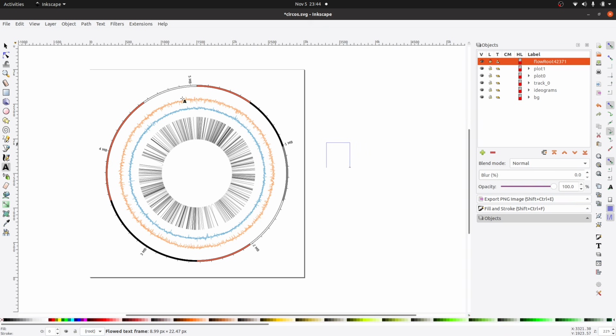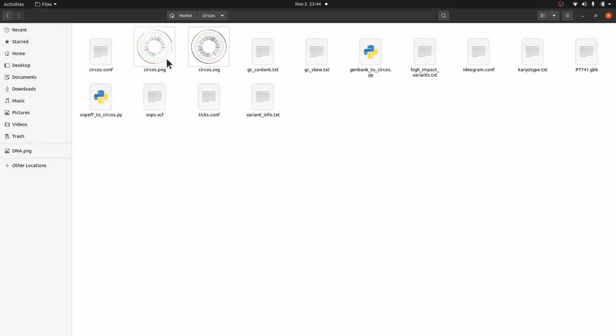That'll be it. Okay, but a detailed description or explanation of how to use Inkscape is beyond the scope of this tutorial. Okay, so those are things that we cover in other tutorials. And of course, you also know that if the images are large, then editing with tools like Inkscape can also be a bit slow. Okay, so that's what you need to also take note of. Okay, but once you open it like this, you can edit and then later add some modifications to it. So that's it. All right. So I'll just exit this one and then that's it.